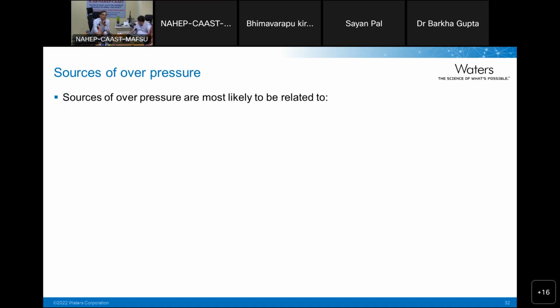So it is better to maintain a logbook, like whenever you are starting an experiment, what is the starting pressure? No, we are not talking of delta. Delta is definitely important to run your analysis, but before that, you monitor.